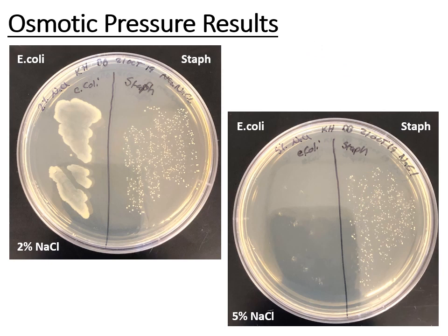Okay, and when you analyze your results in the post-lab, again, please be very specific. Specify the salt content you're talking about, whether it's 2% or 5%. Specify the bacteria you're referring to, whether E. coli or staph, and specify the growth. Is it robust, smeared growth, or is it speckled individual colonies that represent a lesser growth? Or is there no growth at all? Okay, did you see any change in the growth?